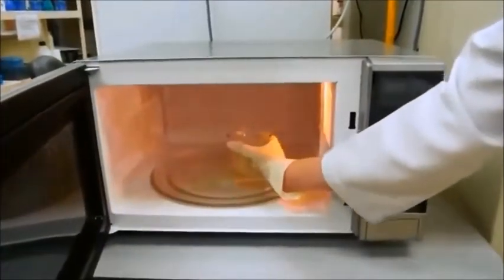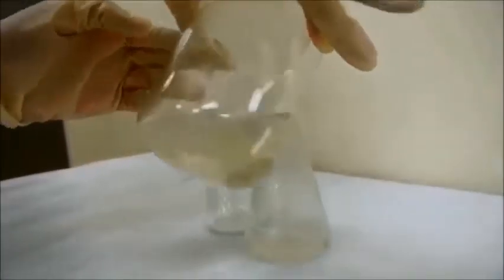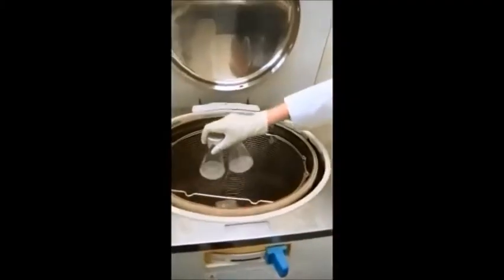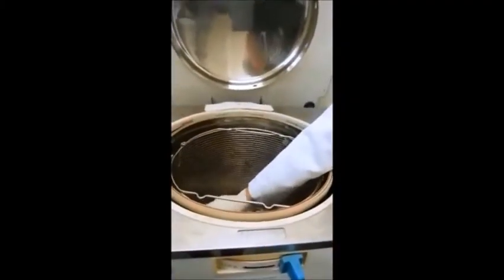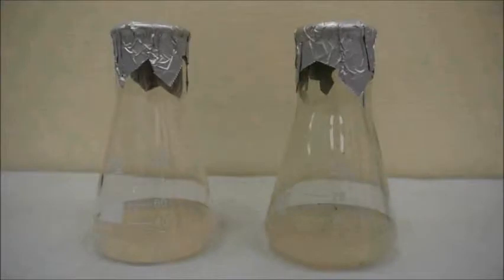After microwaving, the medium was poured into a conical flask. The cap was screwed loosely and was sent for autoclave at 121 degrees Celsius, 15 psi for 15 minutes. Now the medium is ready to be used.